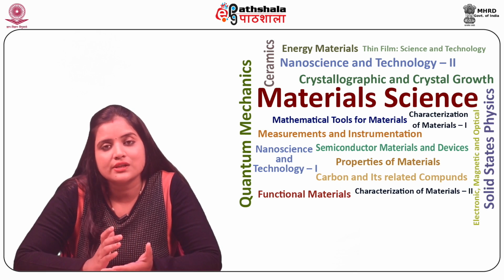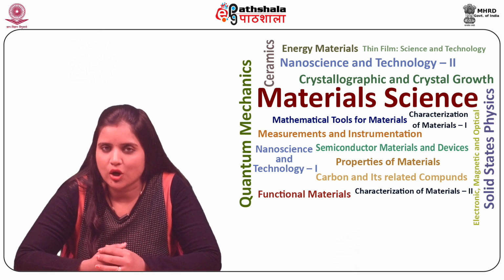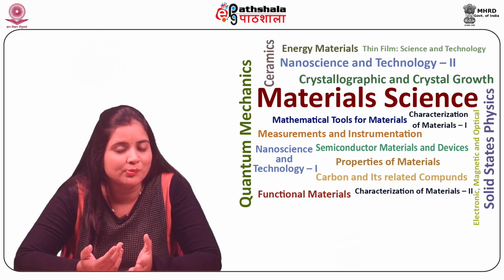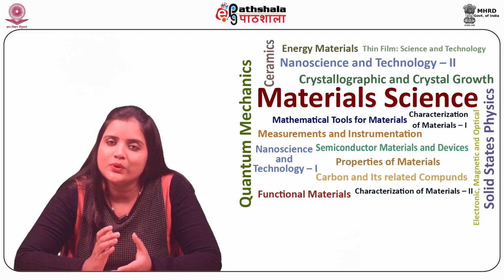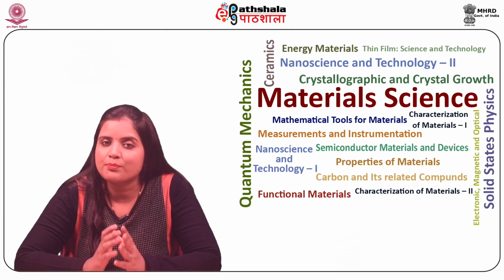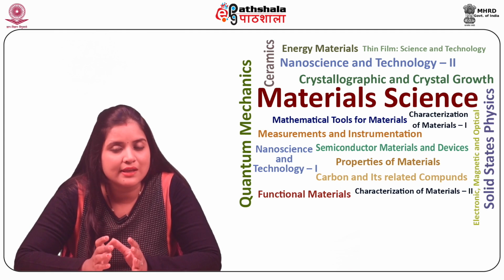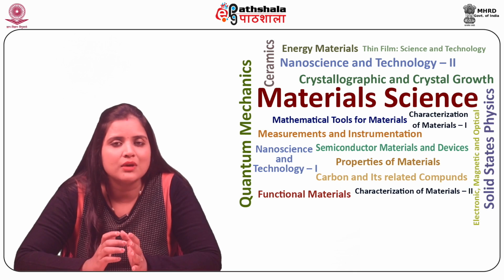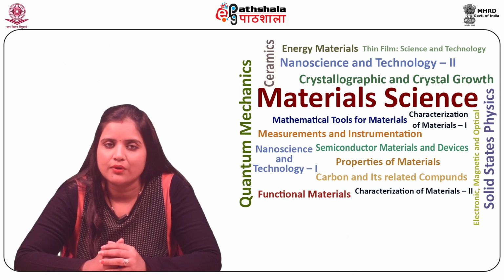We will now discuss the applications of oil immersion microscopy. Oil immersion microscopy relies on using one or more oils on an oil appropriate lens. These lenses can be used for studying inanimate or dead specimens.